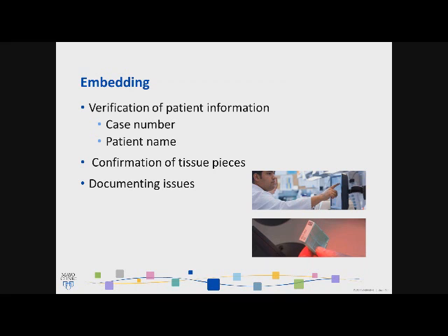The real easy and simple reason we don't do this is because we don't want to expose our lab aids, if you will, to the formalin between those two steps, because after the grossing step, they have to remain in formalin before they go into the processors. But you can also track which processor they go into. You're very familiar that there are different types of processing. There is formalin fixation processing, there is microwave processing.